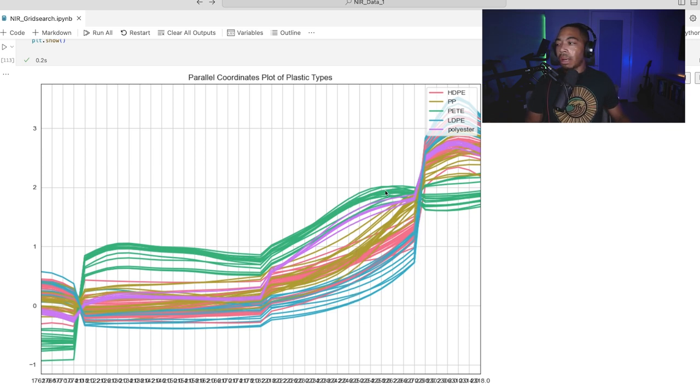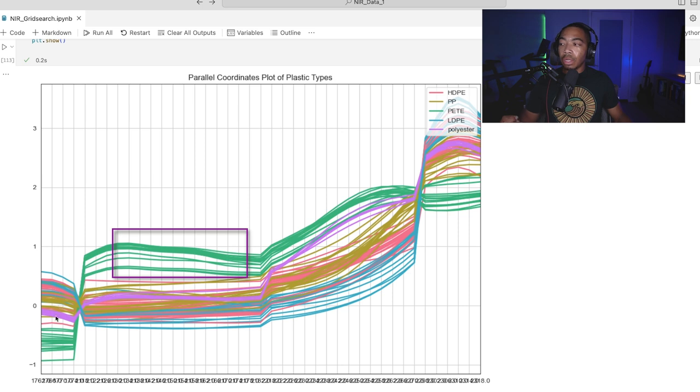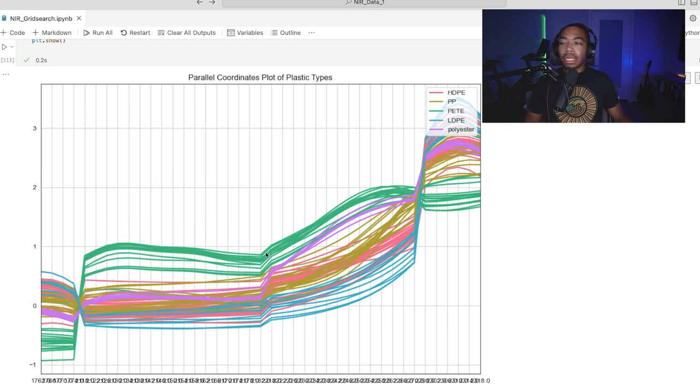Whereas there are some other areas where it's a little bit less clear, but it's really good for picking out polyethylene terephthalate and this green trace here, but discriminating the others is really in this region here.